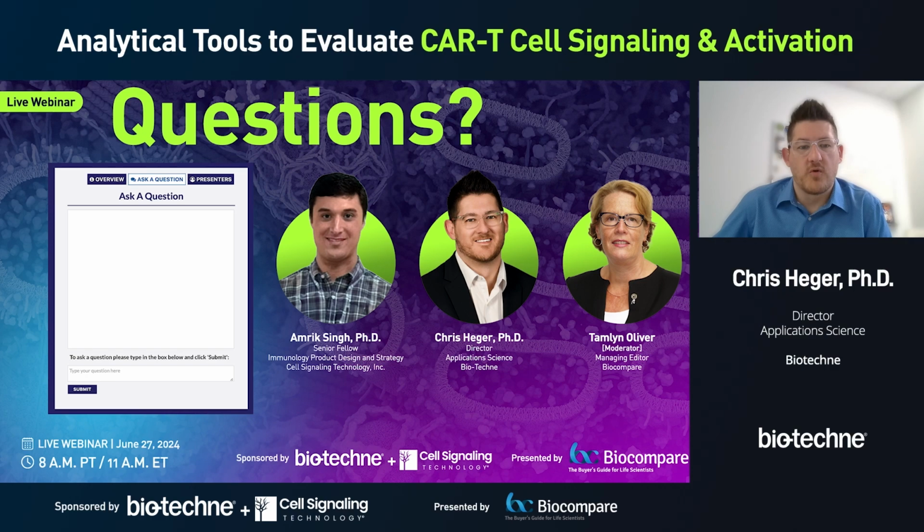And maybe just before we move away from that, we've done a little bit of work showing that you can take an FFPE sample and get it soluble enough for simple Western analysis. You really need that sensitivity that we have. So Rick, we should connect again and see if there's something we can do to push that forward. Absolutely. Yeah. All right, thank you.